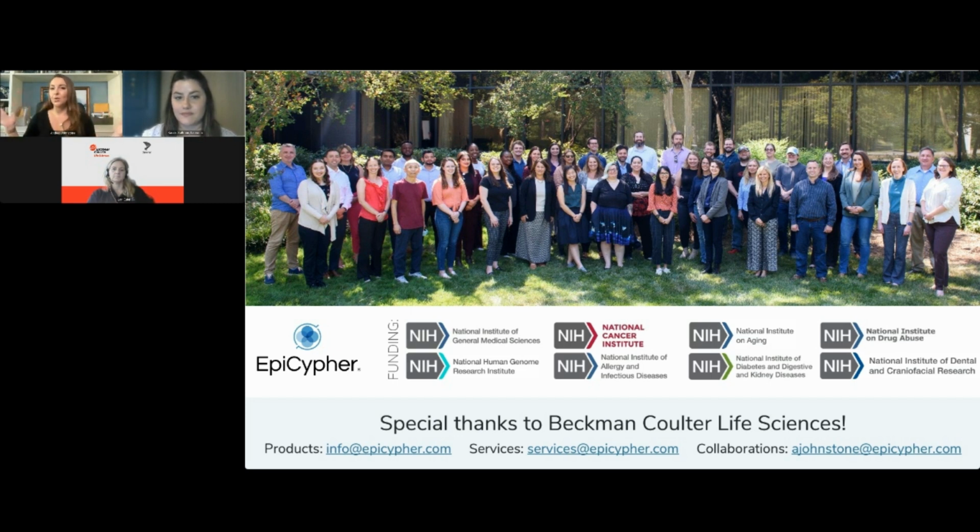In terms of the breakdown between specificity and efficiency or yield, I don't know the numbers offhand for all the antibodies we tested, but we did look at that for those top-cited antibodies, right? The antibodies that everyone in the field uses. Interestingly, I think 90% of them were very efficient. They recovered great yield. They give you nice-looking peaks. The problem is they were not specific. So those peaks that you're seeing, you can't attribute to the target that you think you're profiling. If you're using those widely cited antibodies, which the vast majority of people are, that's going to be your problem. You'll get great yield and great looking peaks, but it's not necessarily the mark that you think you're studying.